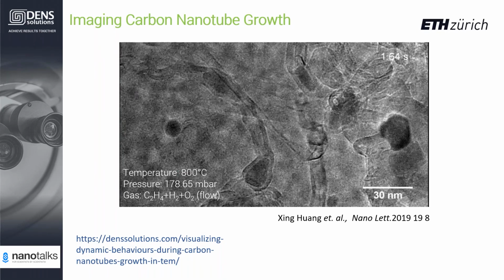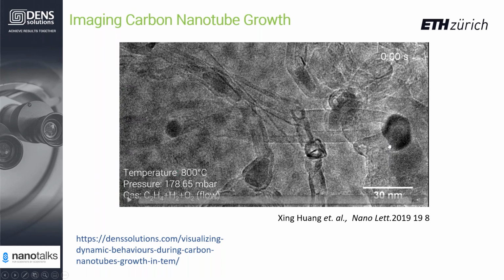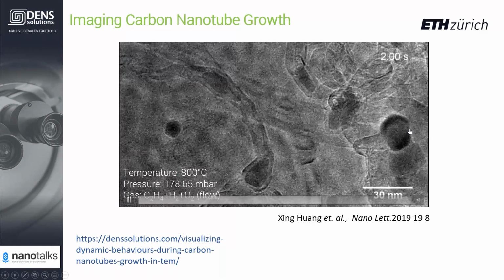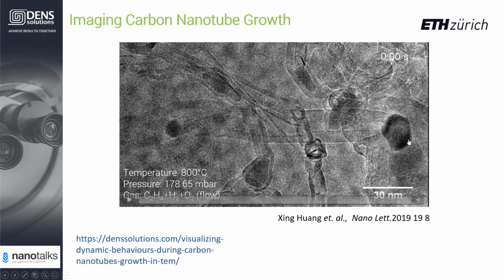they can see that the working catalyst is constantly reshaping on the side of the carbon nanotube growth, while on the opposite side you can see it stays nearly static and very faceted, and the morphology doesn't change during this process.